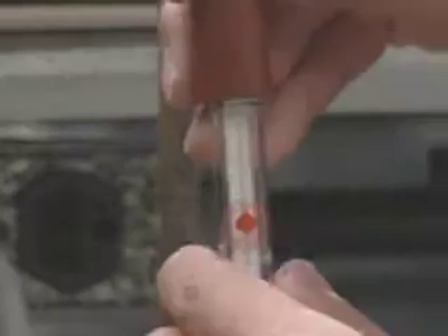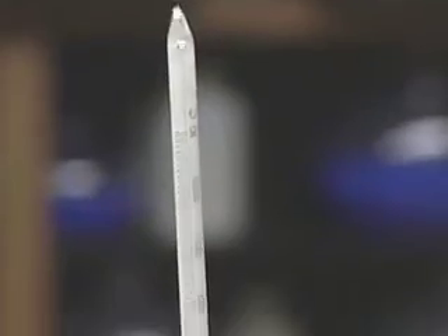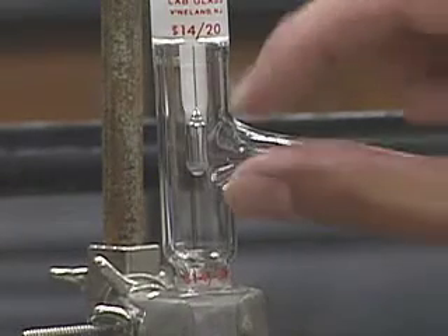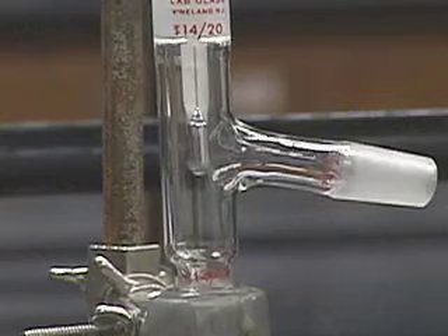You put this all together and adjust the thermometer so that the bulb is even with the sidearm, so that the mercury bulb is even with the sidearm. That looks a little low. It's not absolutely crucial that it be exactly at a certain point, but you want the bulb to be bathed in the vapor, and I'll show you that when we start to heat it up.